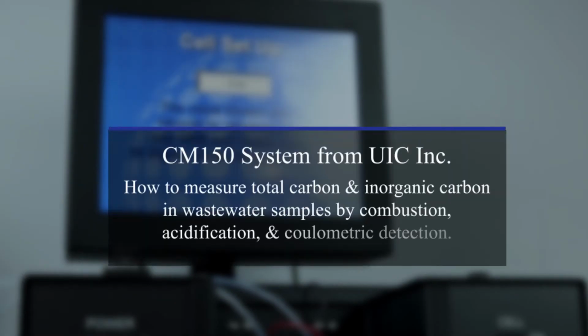Today we'll be demonstrating how to set up and use a CM150 system from UIC Incorporated. We will measure total carbon and total inorganic carbon in wastewater samples by combustion, acidification, and coulometric detection.